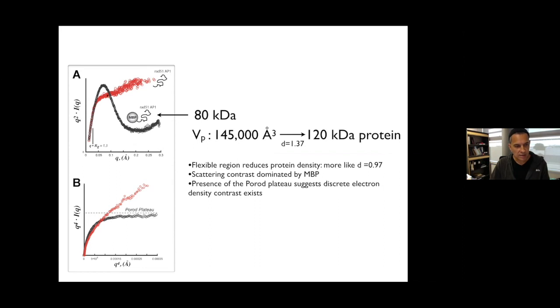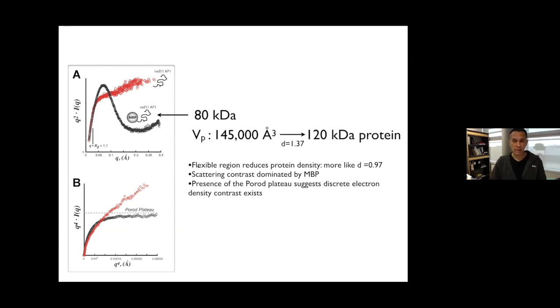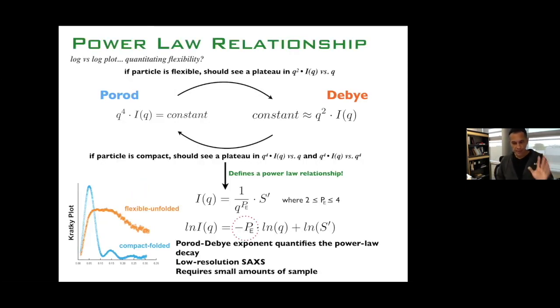Calculating the volume from the biphasic system comes out to ~145,000, which is an overestimate. On the q⁴·I(q) plot, the mixed particle forms a Porod plateau at some point, but for RAD51AP1 alone it just keeps going. The Porod-Debye exponent is obtained by taking the natural log of the intensities — you then get an exponent on a power-law plot, which you fit.